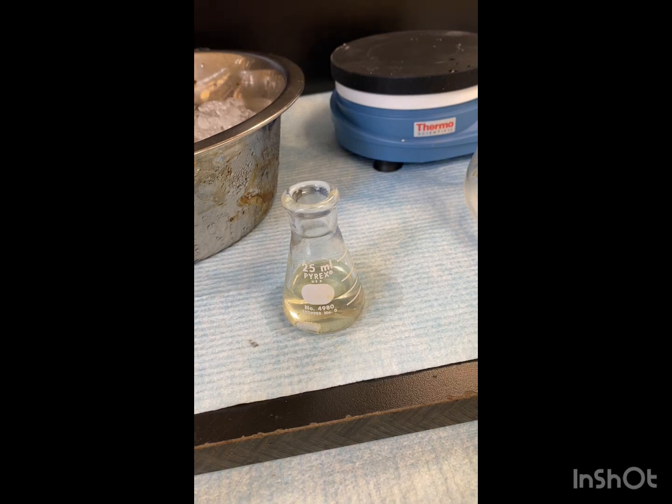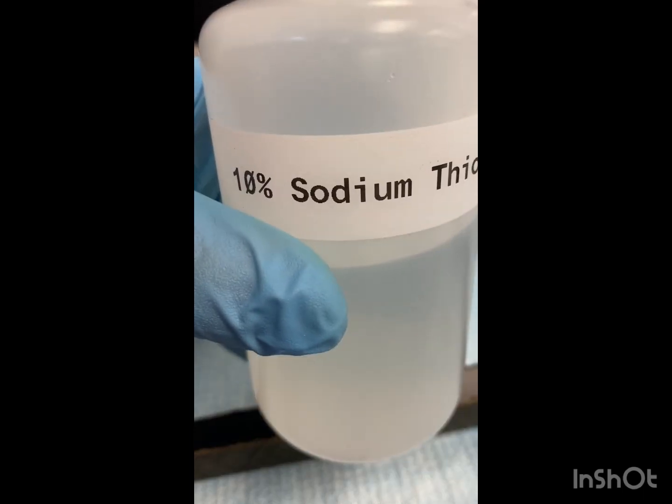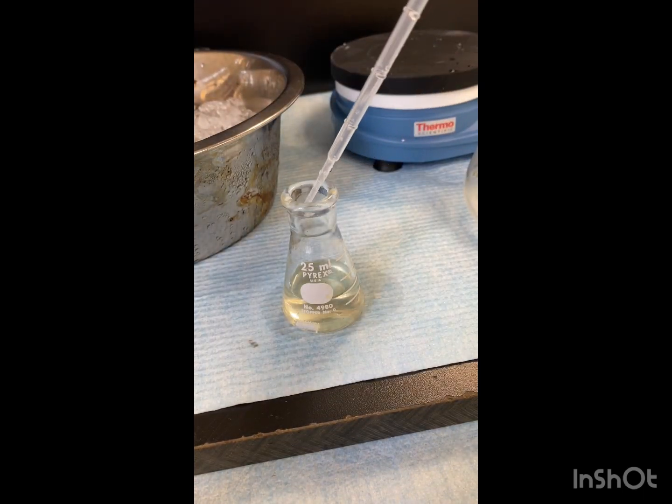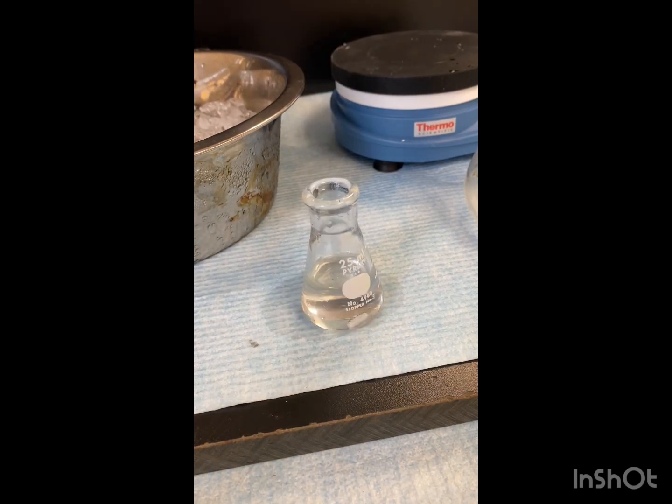Our solution has been resting for about 10 minutes. Now we're going to add around 3 ml of our 10% sodium thiosulfate. Now we're going to acidify the solution with 3 molar HCl, and you can check the acidity of the solution with blue litmus paper. We're going to add some HCl dropwise and check it periodically for its acidity.